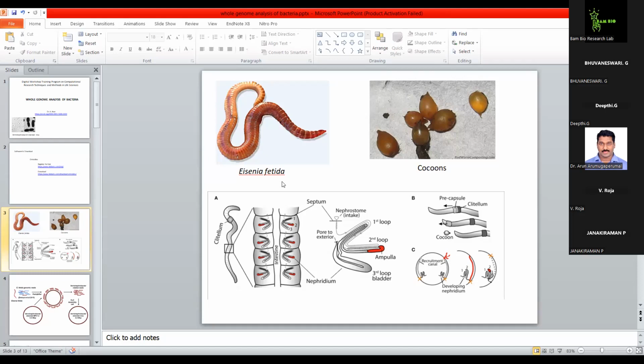If you have the sequence and are able to analyze it and get meaningful data from it, you have the whole blueprint of the entire organism. That means you can map all the morphological features to the DNA sequence. To analyze the sequence of an organism, first you have to take the organism, extract or isolate the DNA from the tissue, and then go for sequencing. Sequencing is nothing but finding out the order of arrangement of the A, T, G, C nucleotide bases.